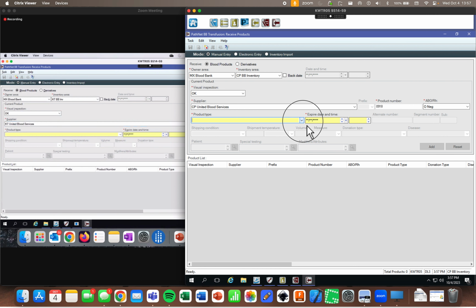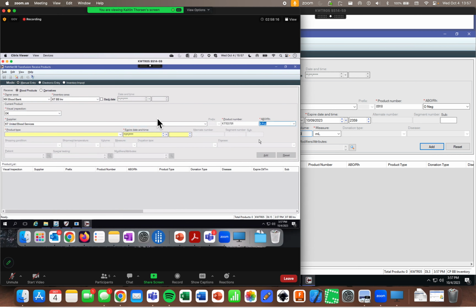And then my product number. Let's see, what are we doing here? So we'll do initials, test 01. This one will make a positive, but no, that's not a typo. There's usually a reason for my madness.